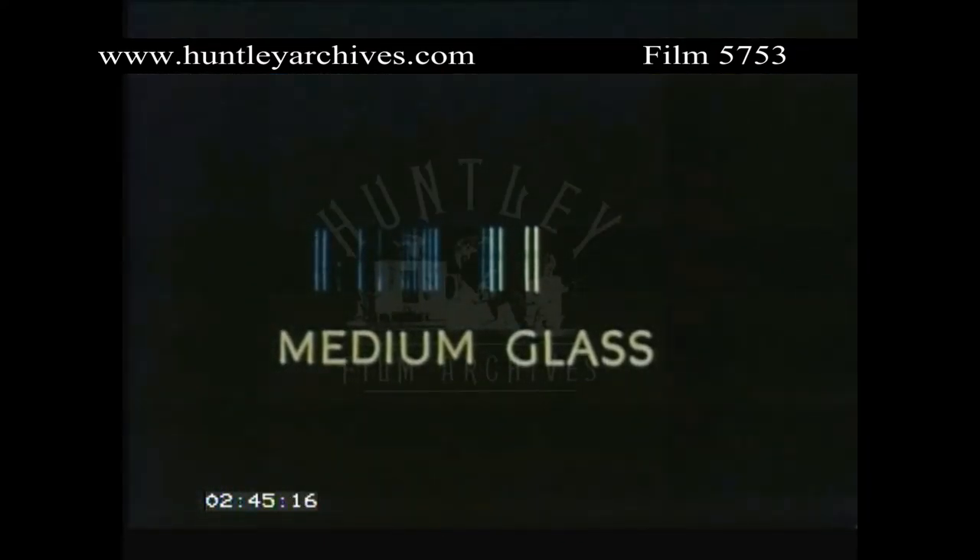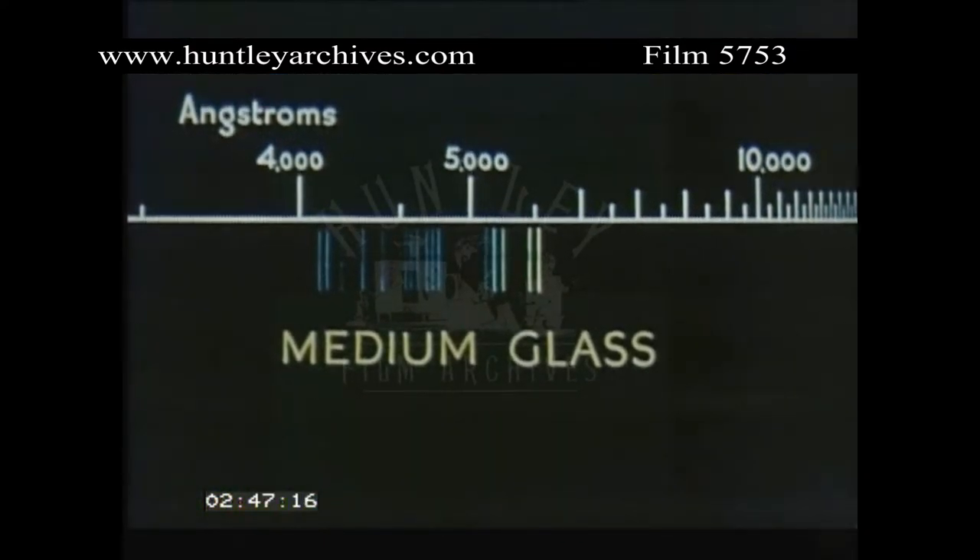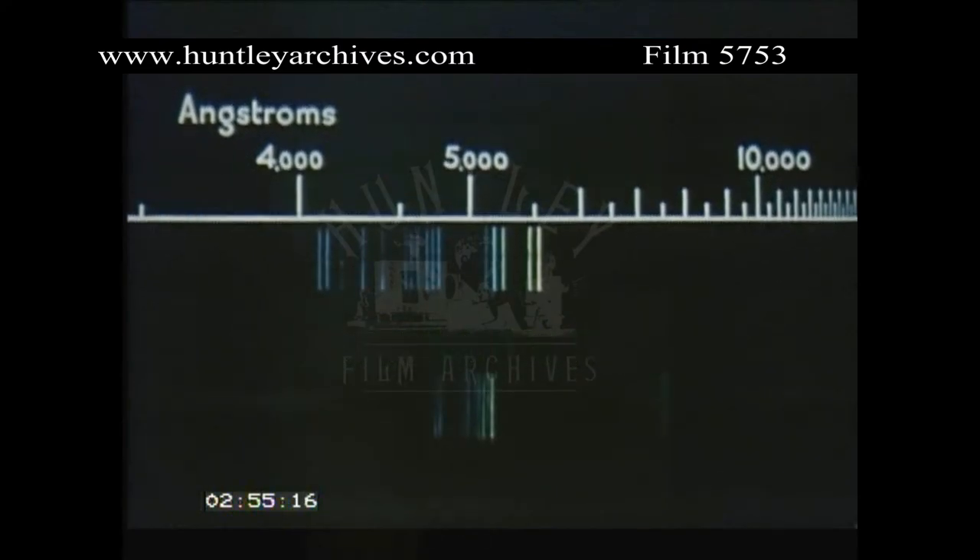The spectrogram now produced has lines with much greater separation. A wavelength scale, usually marked in angstroms, makes it easier to identify and measure wavelengths than with the smaller instrument.